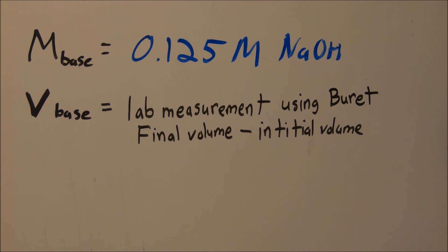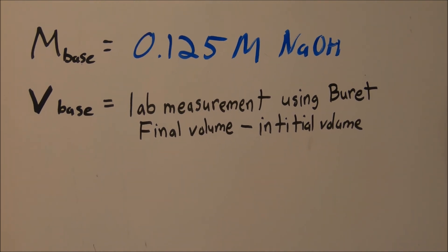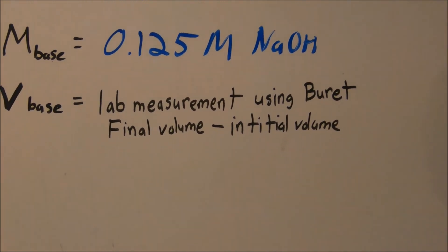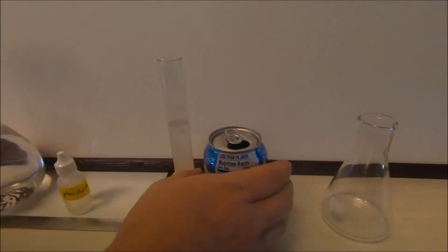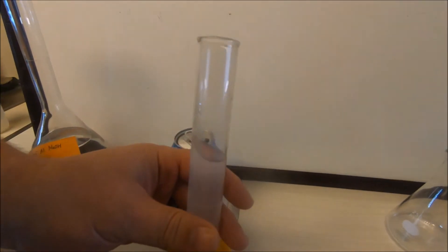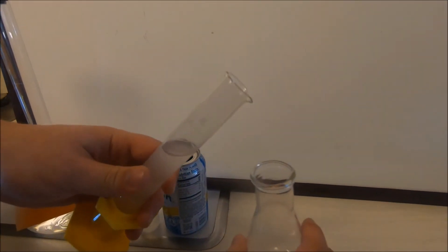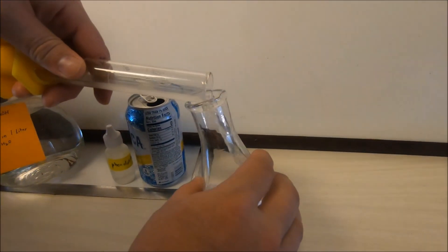Our next step now is going to be to find the volume of that base. We're going to start out taking our Fresca and adding it to the Erlenmeyer flask.